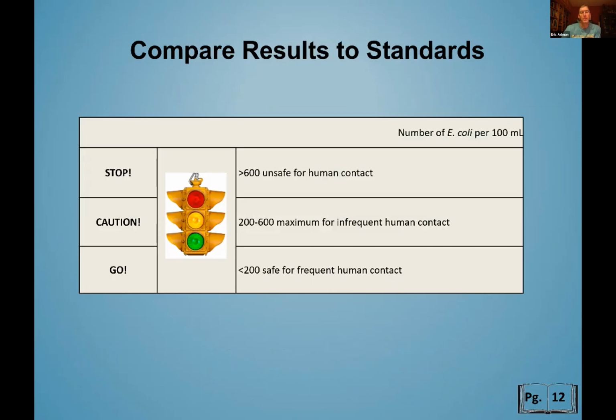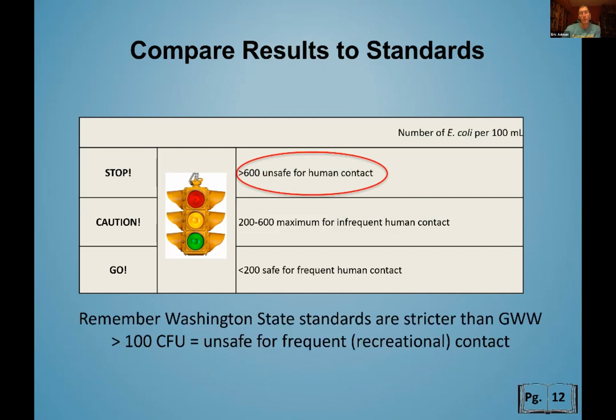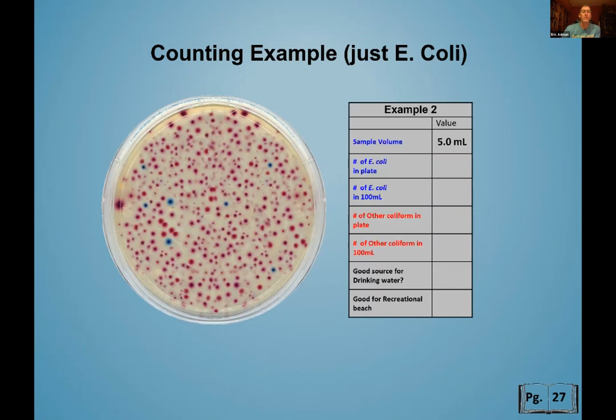So we compare it to our standards. By Global Water Watch standards, it's not safe. And by Washington State standards, it's definitely not safe. So we'll do a couple more exercises.